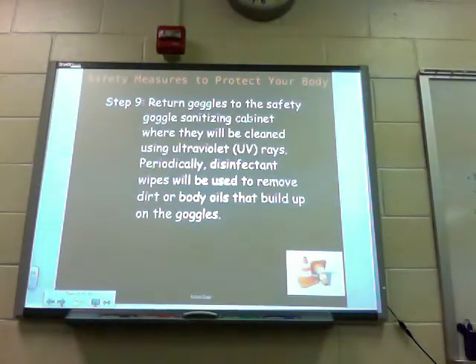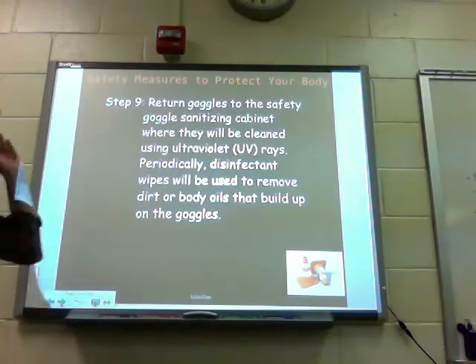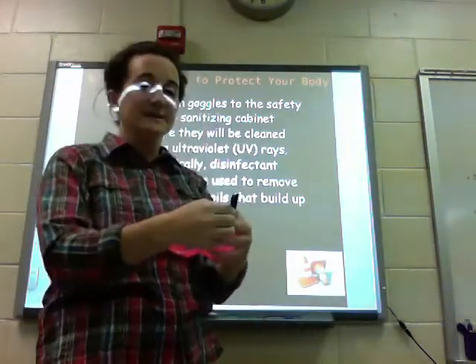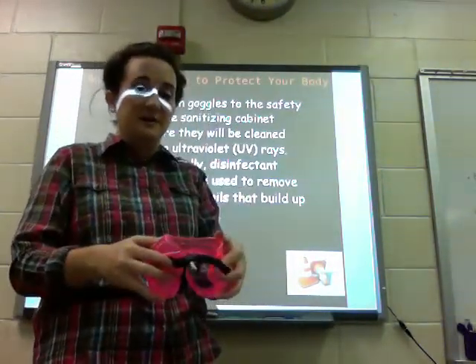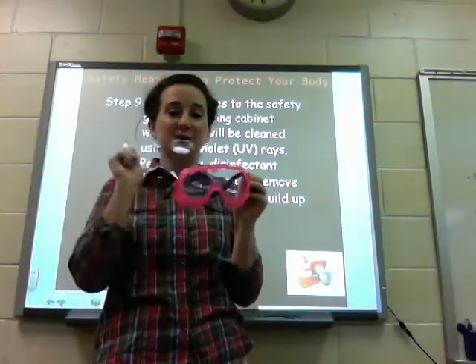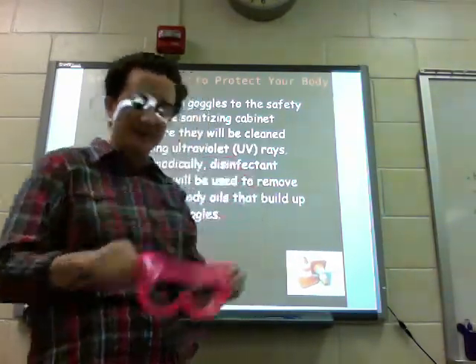Step nine: return goggles to the safety goggles sanitizing cabinet where they will be cleaned using ultraviolet UV rays. Periodically, disinfectant wipes will be used to remove dirt or body oils that build up on the goggles. Please do not tighten the straps so much that they bend the goggles — last year we had several break, and these are brand spanking new just for you, so please do not bend them and break them.